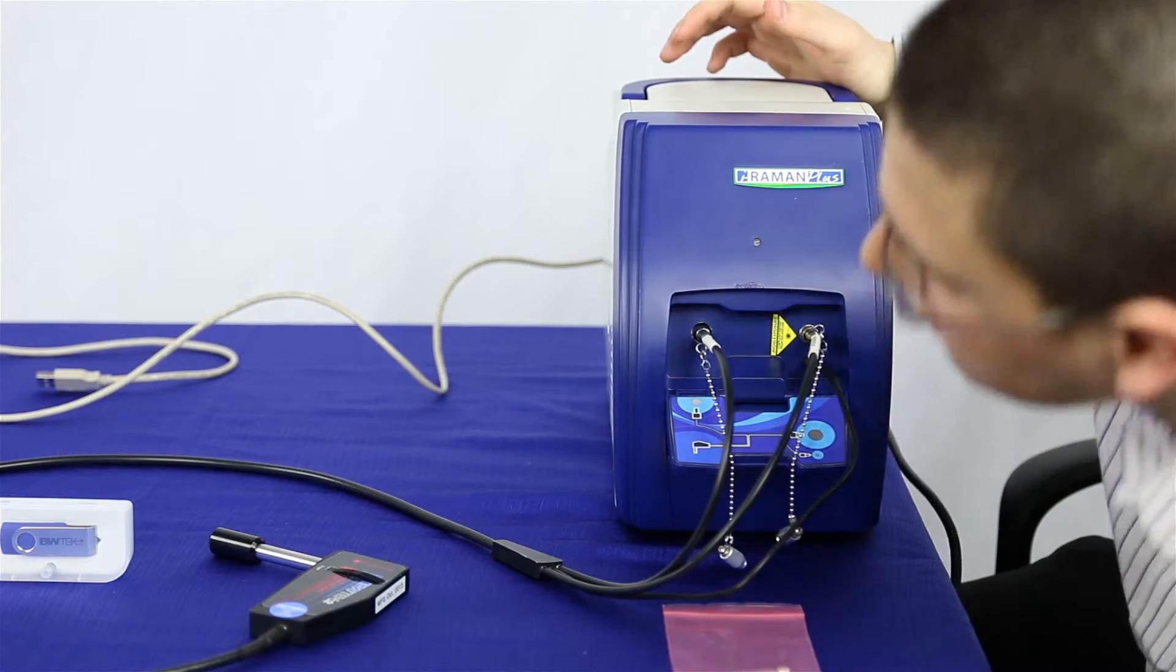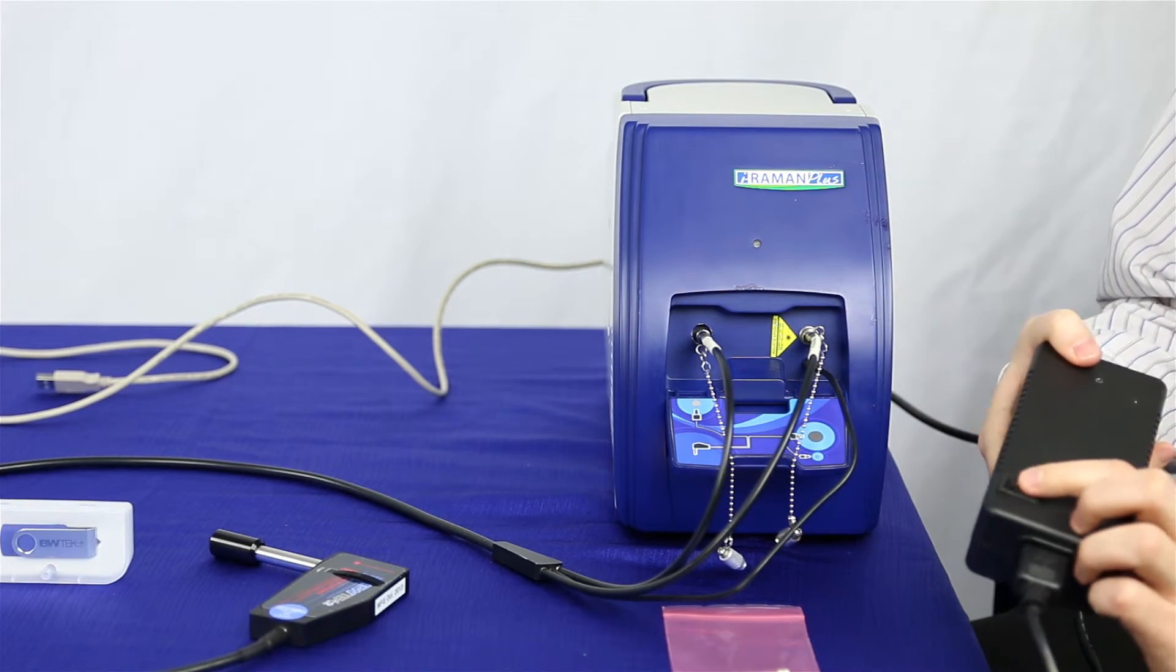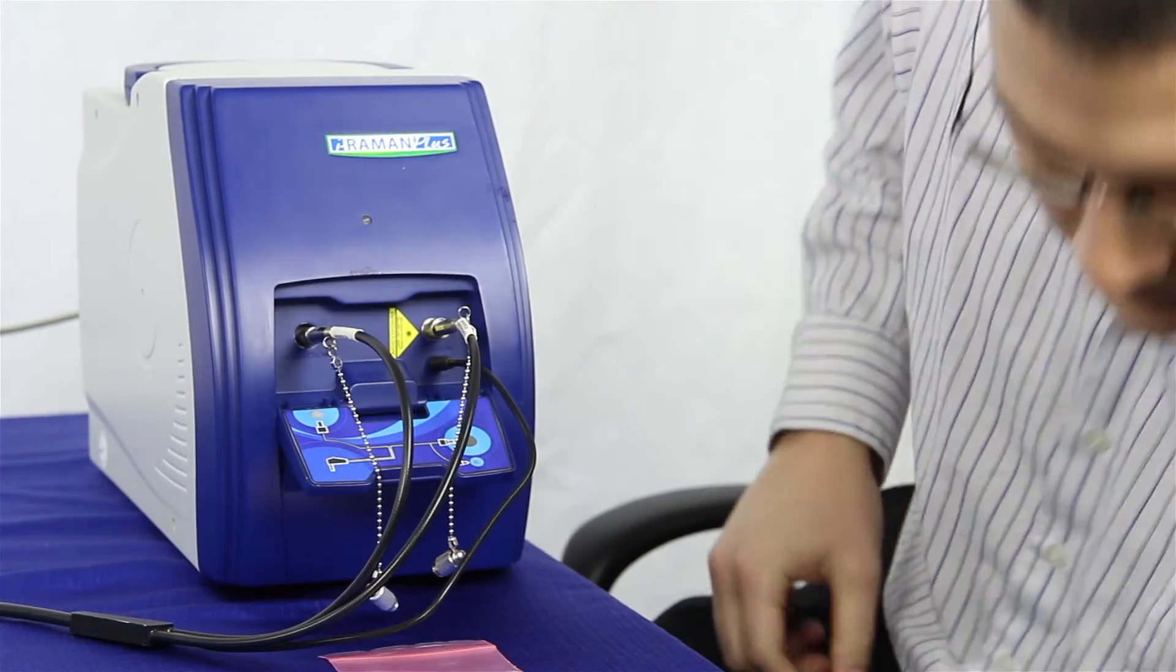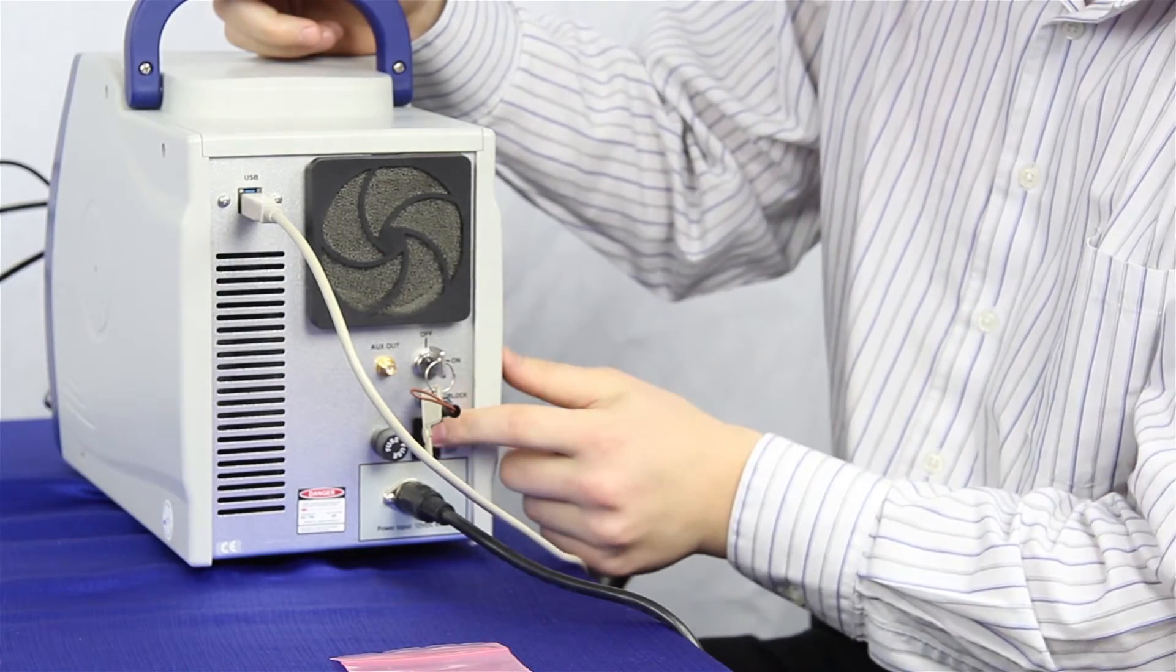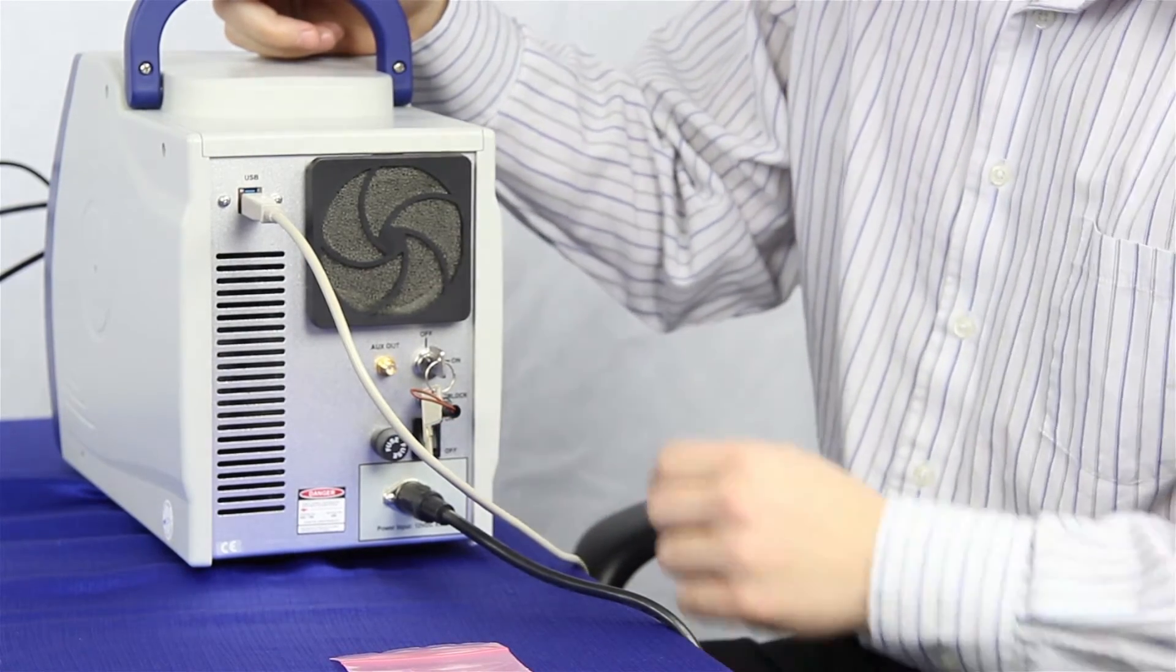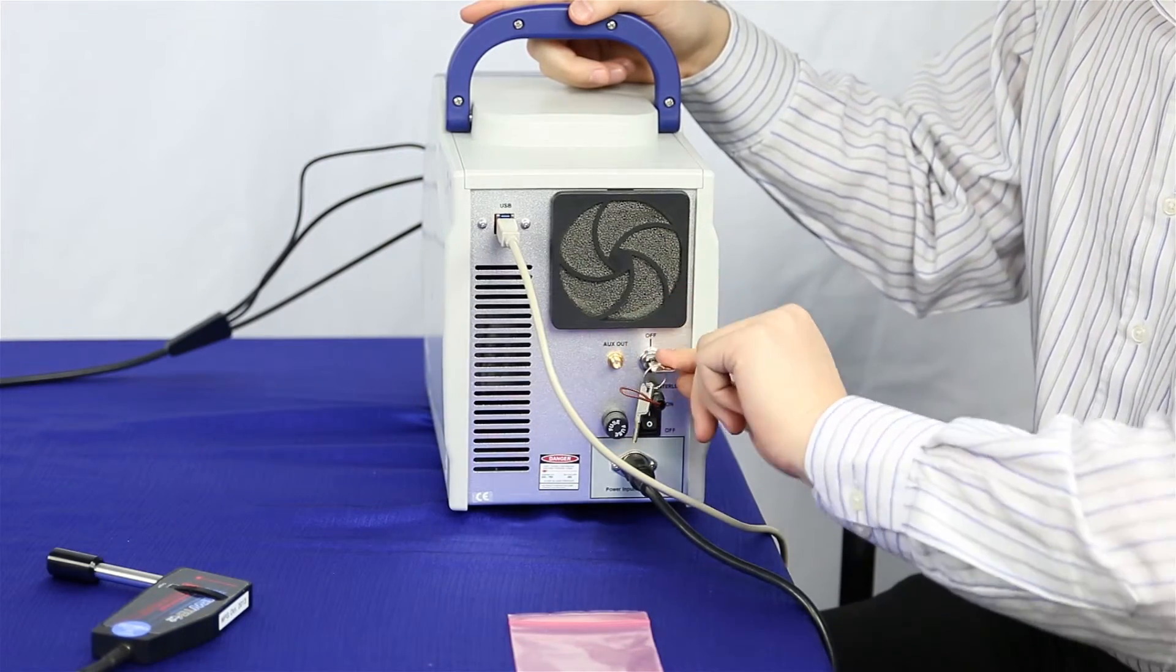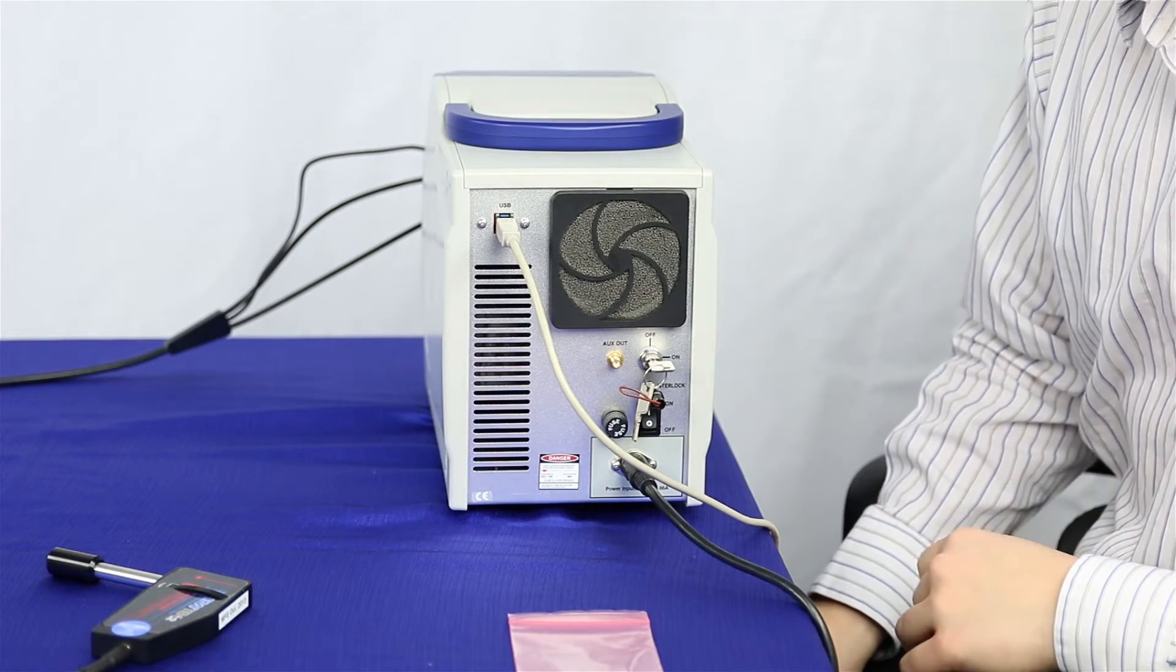Now to turn it on, first of all, you'll want to make sure you turn on the power switch on the power supply. Next, you'll want to turn on the power switch in the back. And finally, you'll want to turn the laser key to the on position. This way, your unit is operational.